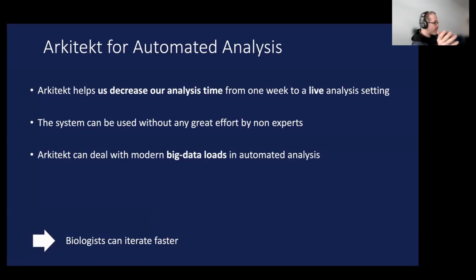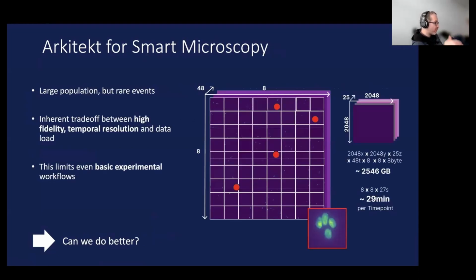This is a question I would ask you about. You called about Micromanager. Will Arkitekt manage to play with Micromanager in order to control the microscope in the pipeline with the output results? Smart microscopy. Cool.